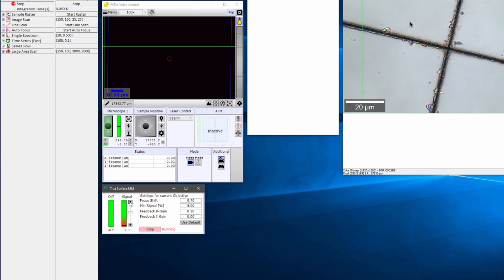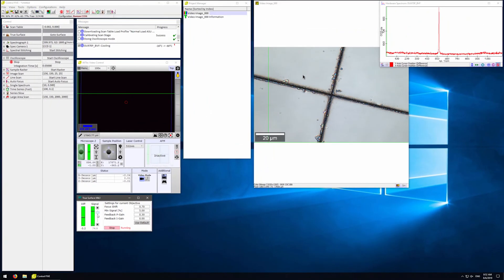We want to adjust the signal level to get the best results. TrueSurface is now automatically adjusting the focus of our sample. TrueSurface is especially useful when imaging a sample that is not perfectly flat, as it will adjust the focus at each point of the Raman image.